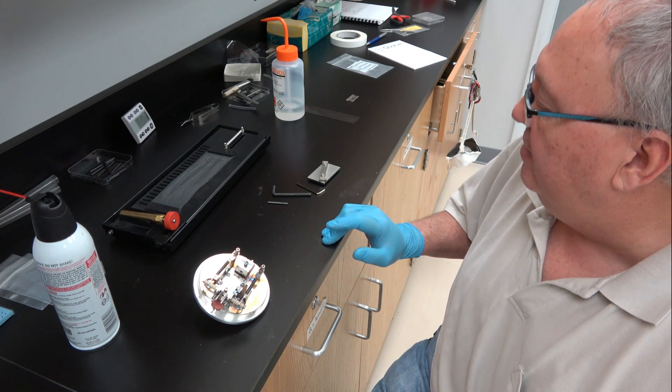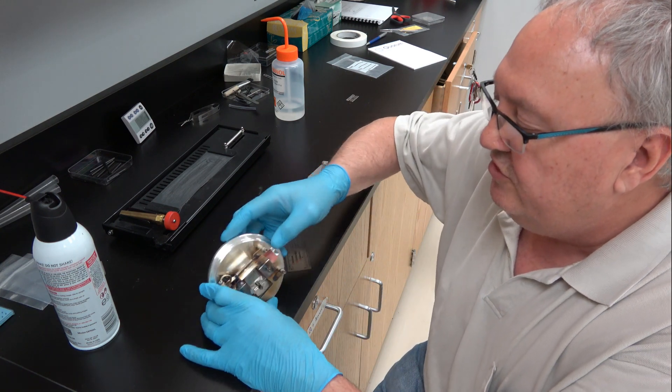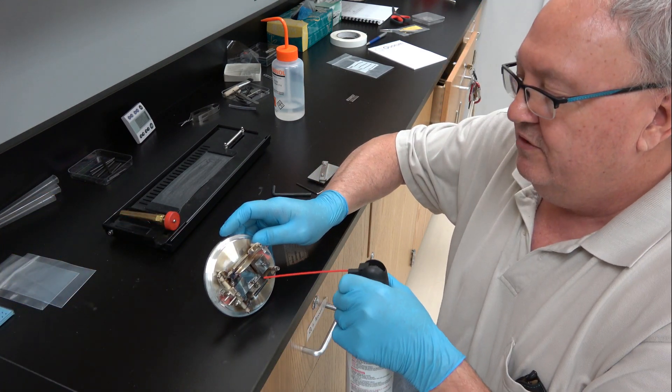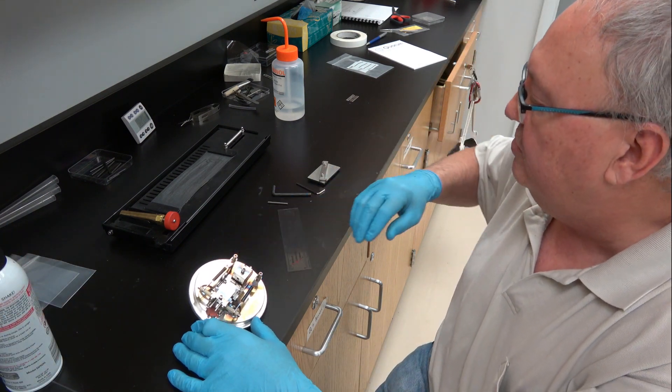The first thing we must do is prepare the carbon evaporator insert for rods. What you see right here — the first thing we do is we blow off any extra carbon that might be stuck to it.